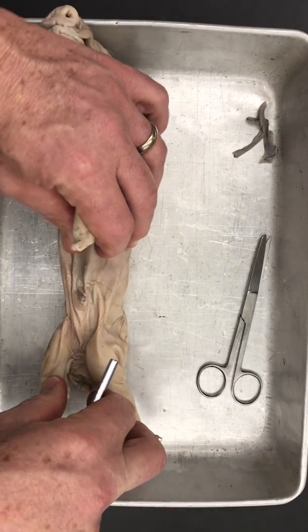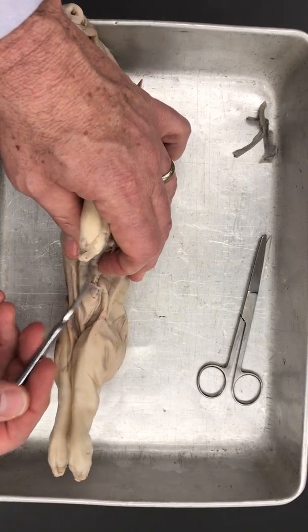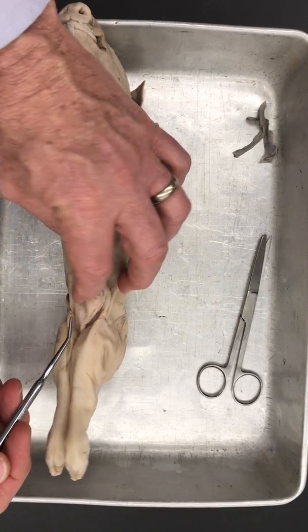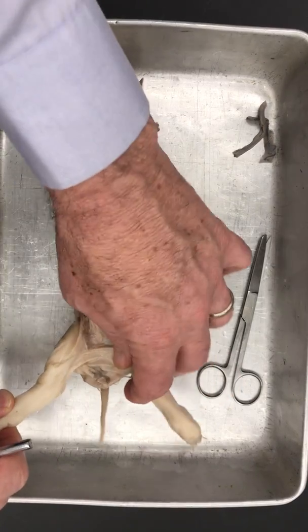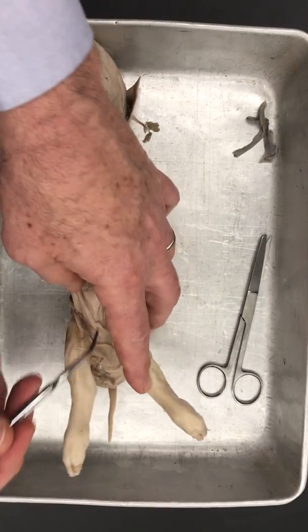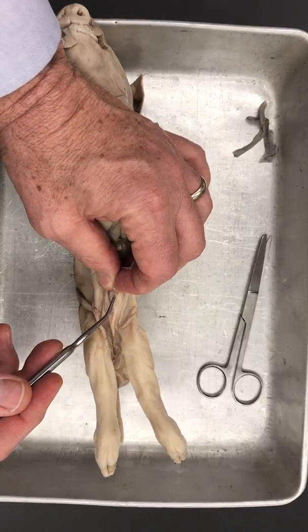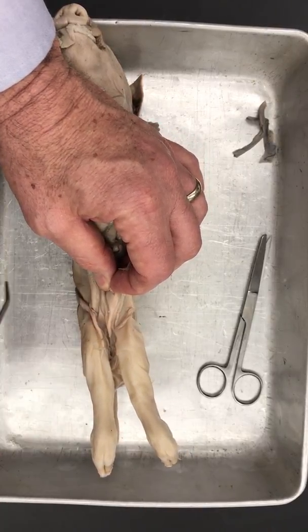You can see that it has these teats or mammary papillae, right? So if this is a female and it's not, those would turn into mammary glands and it would feed the hog. So what is this guy, male or female? So back here he has a scrotal swelling, so he's a scrotum. This is a male, and then right here there's a little opening. That's the urogenital opening. So that's where urine and semen are going to come out. So this is a male.